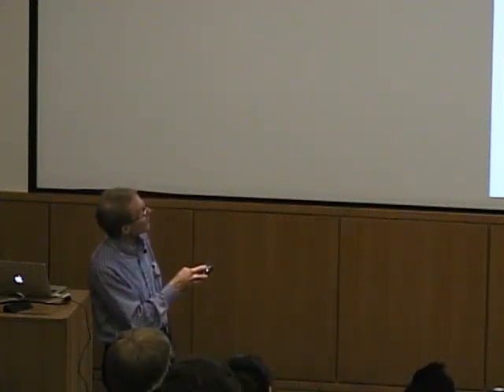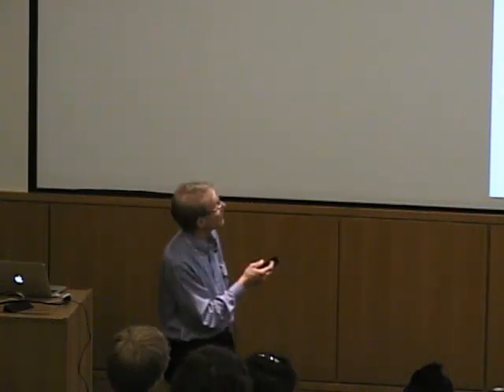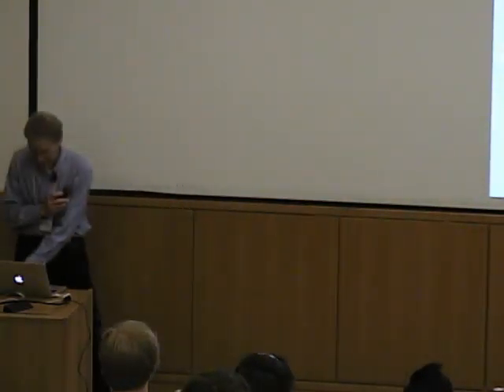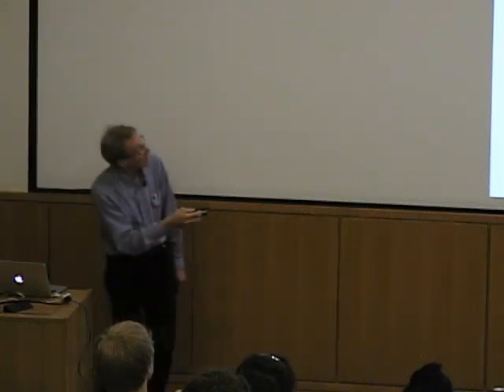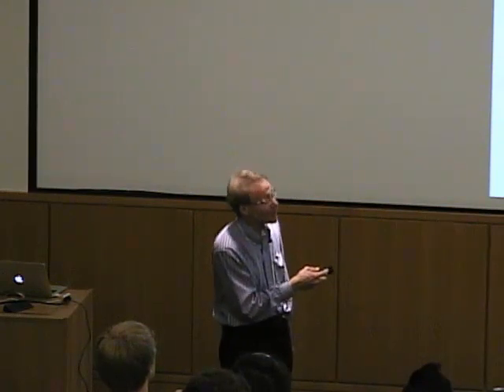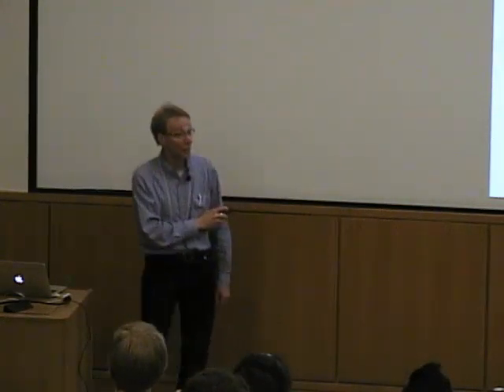Okay? And when we think about what's going on here, let's all think about this together. We've got copper interacting with the buffer, azurin, probably some protons are being displaced from that thiol, okay, at least. Copper will bind to the protein, and then we've got the protonation of the buffer. So there's all these things going on that are leading to the heat that we measure. Right? So this is the sum of it all, okay? And the key thing here is m. How many protons are being displaced from azurin when copper-2 binds? Because that adds a heat contribution, which can be sizable, to what you're measuring.